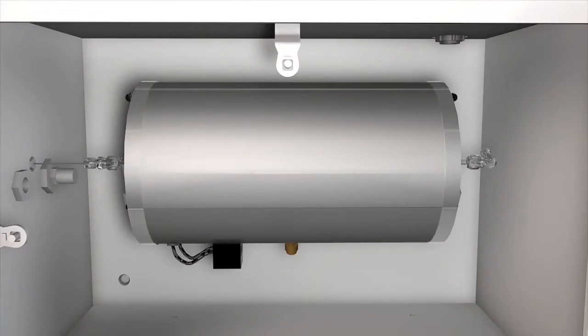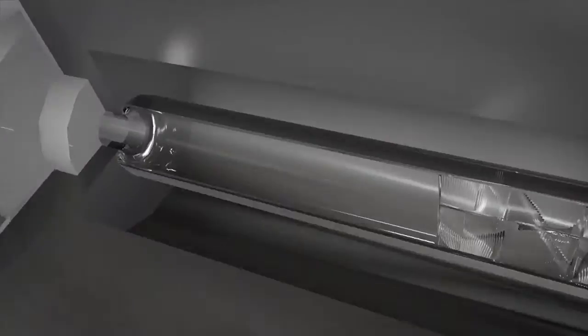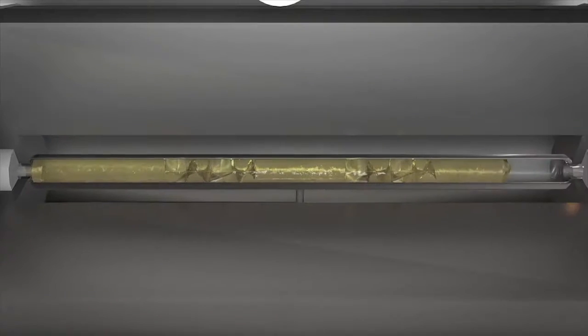As the sample is moved into the furnace, the sample is mixed with a combustion gas and injected into Antec's unique furnace.